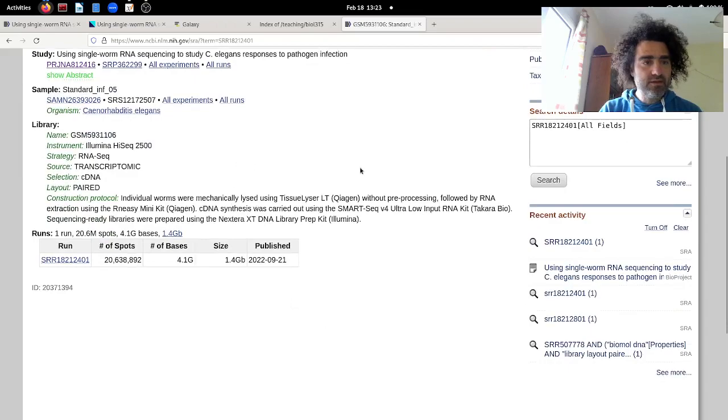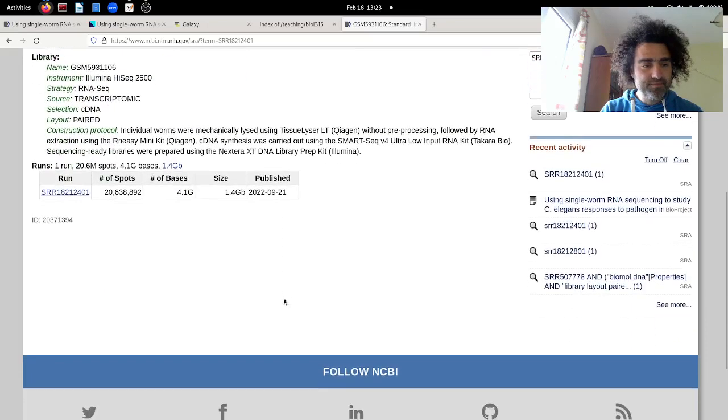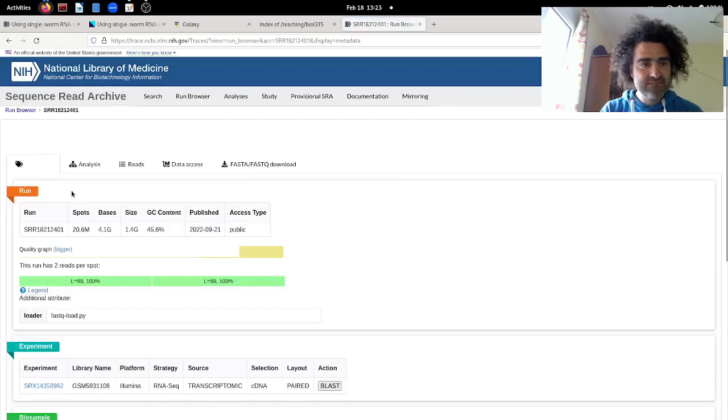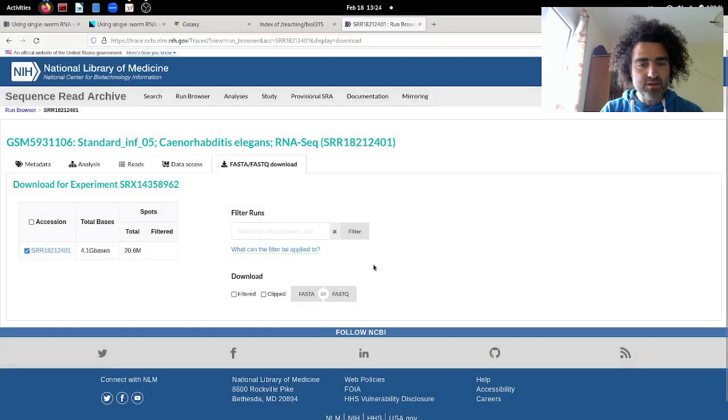Okay, this is the web page that describes just one sample here. It writes that it contains 20.6 million spots, 20.6 million reads. I can go here and get it. So if I click here, FastQ, I can download it.